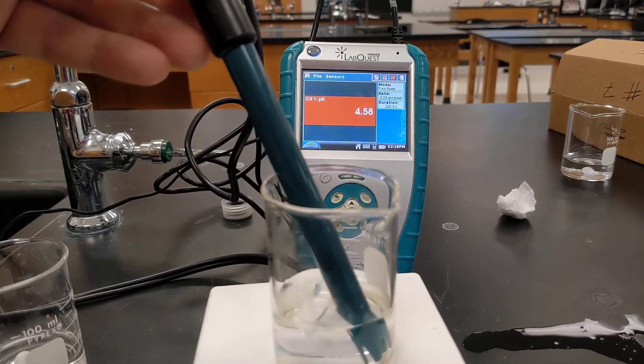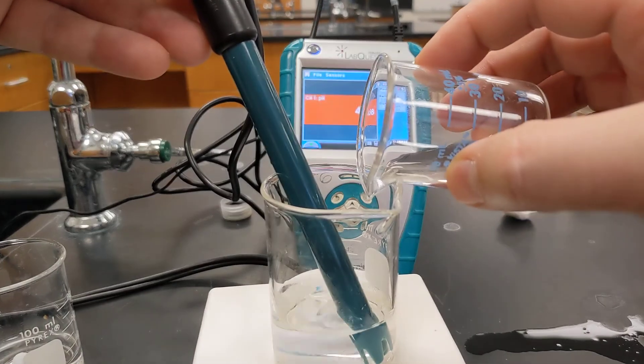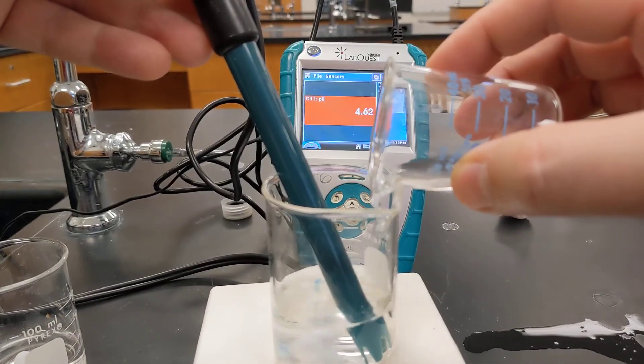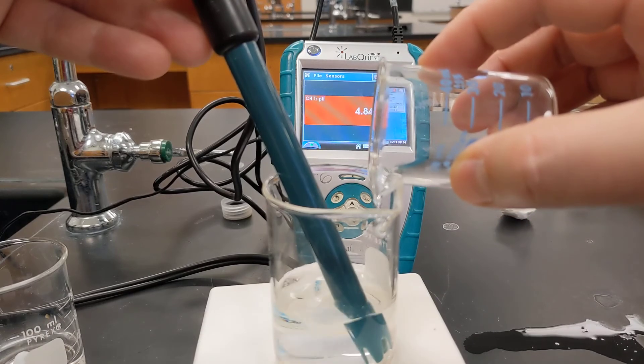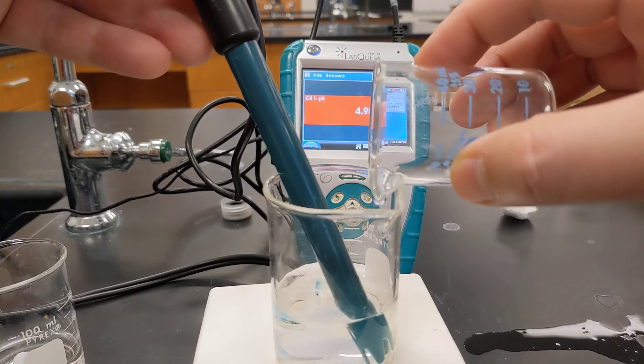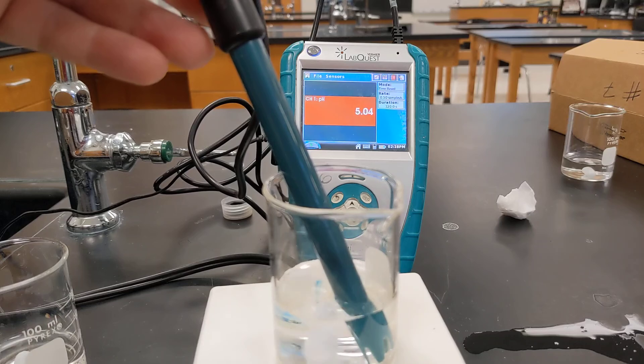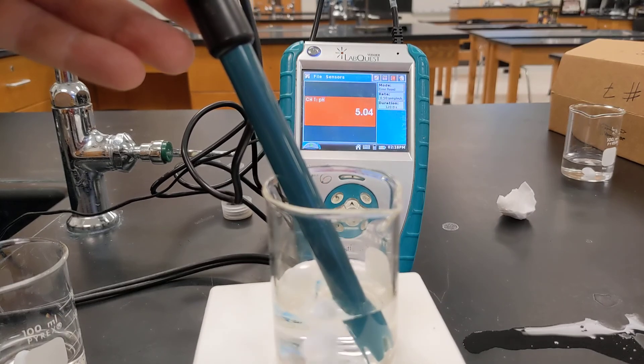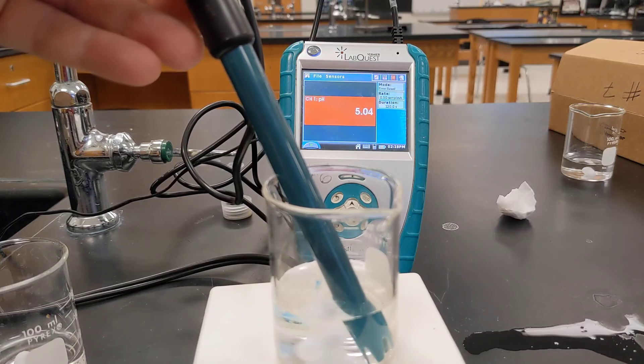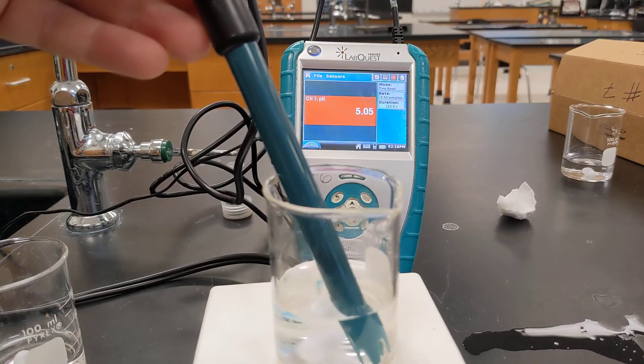Similarly, if I take the base and I start adding it, I'll just pour it in instead of using the dropper. You can see the base brings the pH up, but I'm adding a whole lot of it, and the pH did not change by a huge amount. So that's the benefit of buffer solutions is that they resist changes in pH. So there you go.